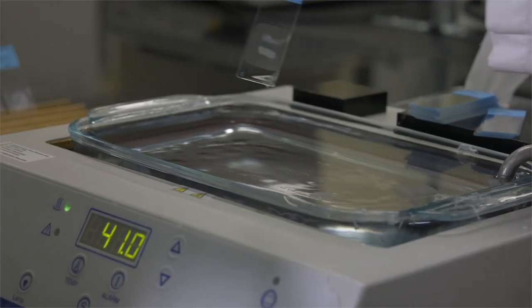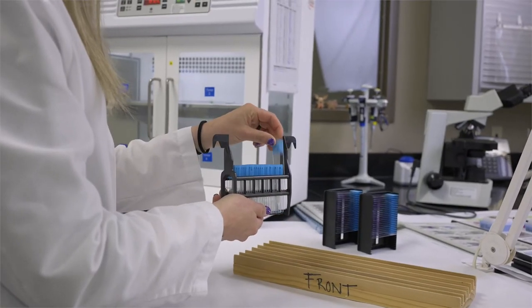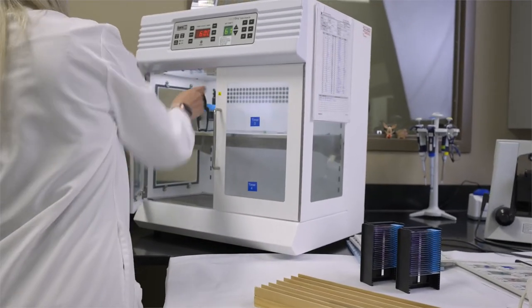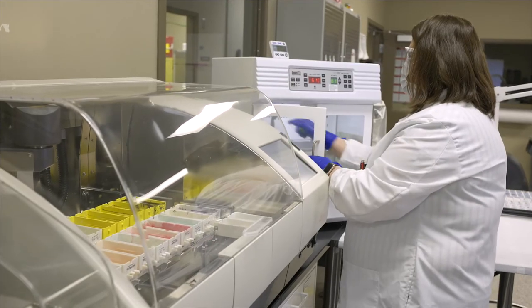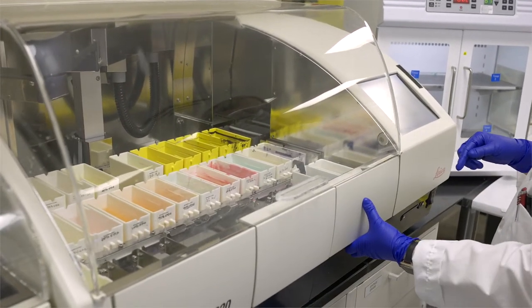The glass microscope slides containing the tissue sections are heated in an oven at 60 degrees centigrade to melt the wax so the tissue adheres to the slides. The paraffin slides are now ready for staining. We'll get into more staining detail later in the video.